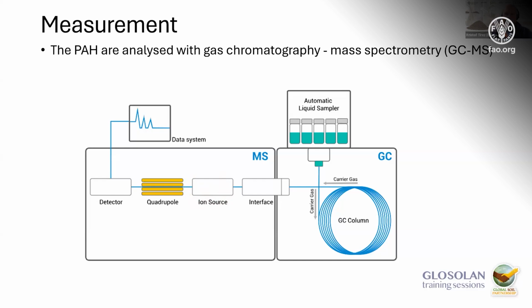You were just mentioning the sensitivity. Is this the first aspect you would see if there is an issue with sensitivity, that you have to clean your instrument? Yes, that's in general. The sensitivity goes down when the instrument is becoming dirty.